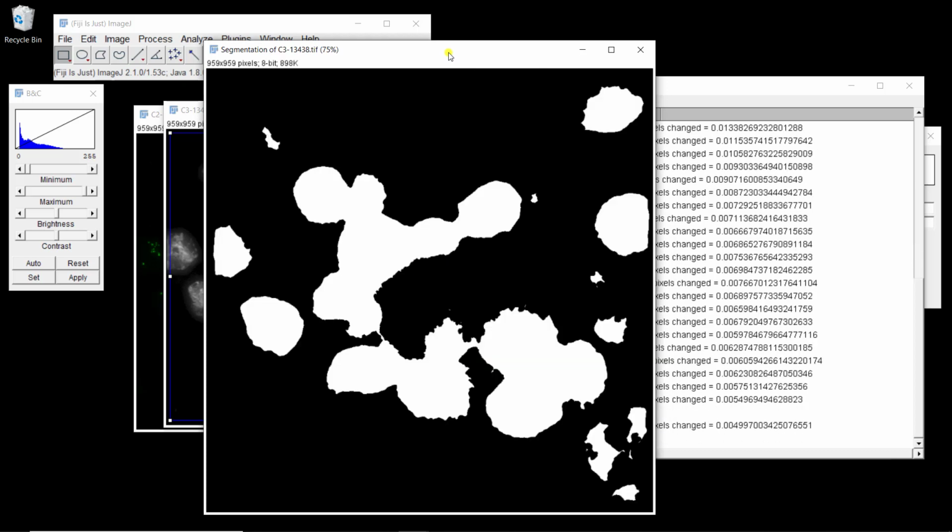Alright, it's done. So as you can see, it's not perfect. We identify more or less all the nuclei, but sometimes in very small size, so obviously this is not going to help much. Again, I'm not an expert with level sets, and another parameterization might be successful here. But as it's not great with this one, we're going to move on.